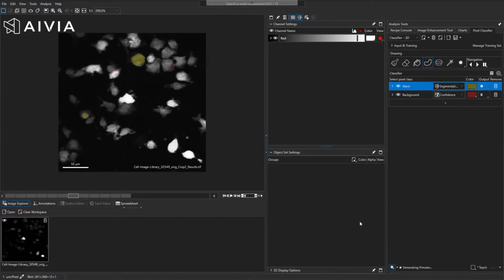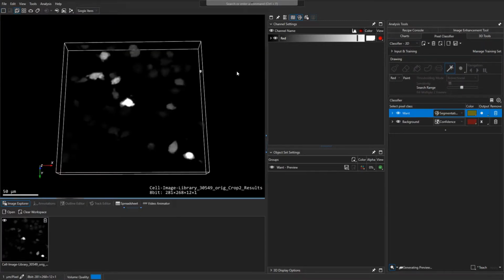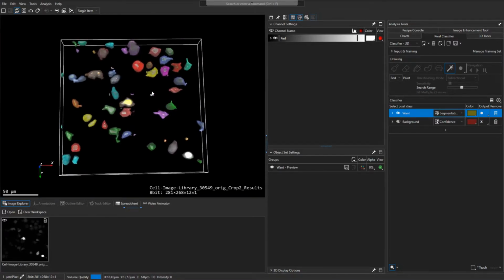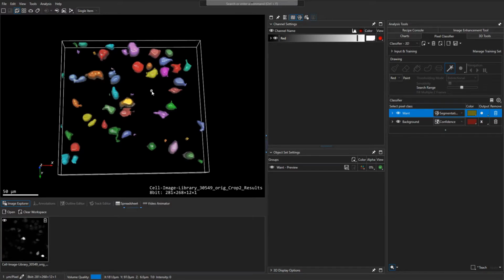I can get the segmented objects in a very fast way because it's relying on the GPU of the machine and it's very fast. And it means also that I can switch to 3D and get the sense of what's happening in 3D in terms of segmentation. So now that I have these results, I will send this to Jim, my colleague, and he will review that with you.